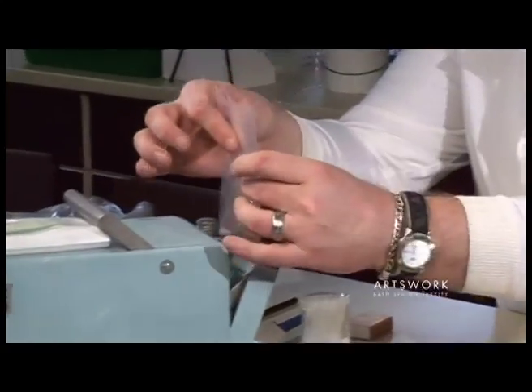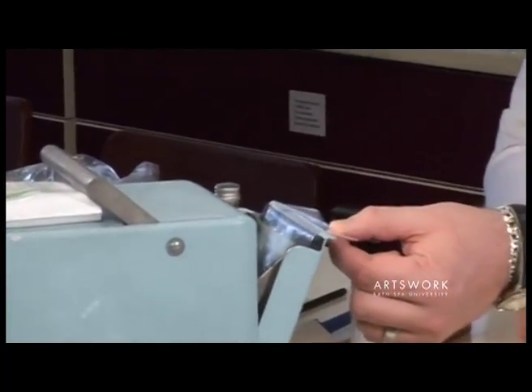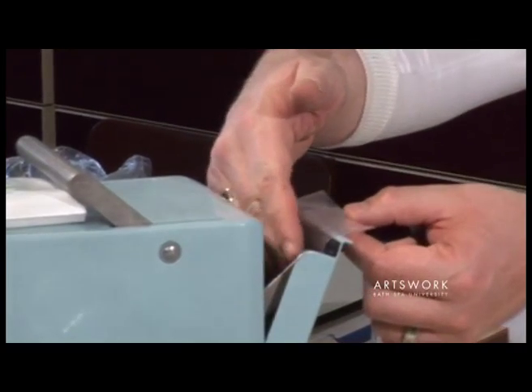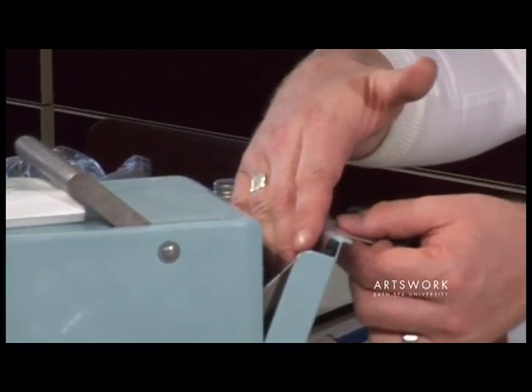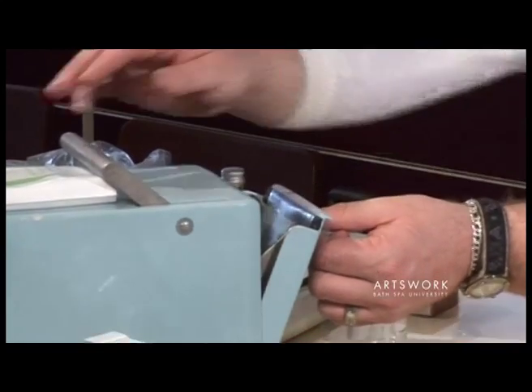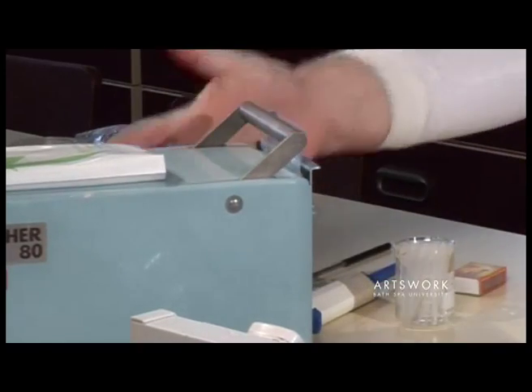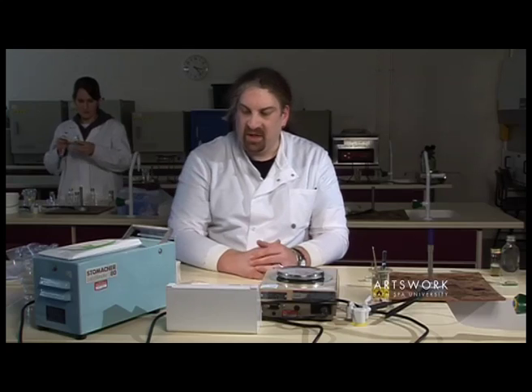So open the door, slide the bag in, making sure you've got some overhanging the door. Just gently squeeze out any excess air, hold the bag over the edge of the door, and just close the handle to seal it in. Then turn that on for one minute.